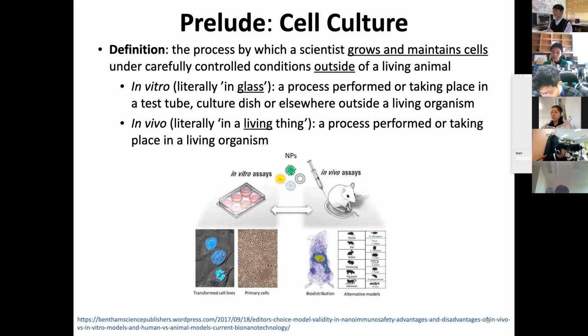So if you look at these pictures, this will give you some idea that in vitro assays usually have plates, well plates, and the pictures you are observing show the cells on top of a plate. So this is more like a two-dimensional shape, like an egg plate when you are cooking an egg, with a large number of cells. Here it says transformed cell lines.